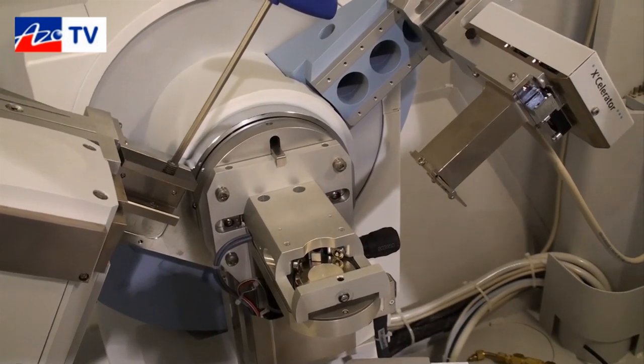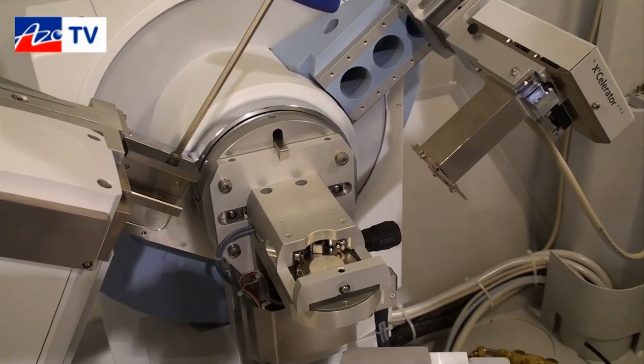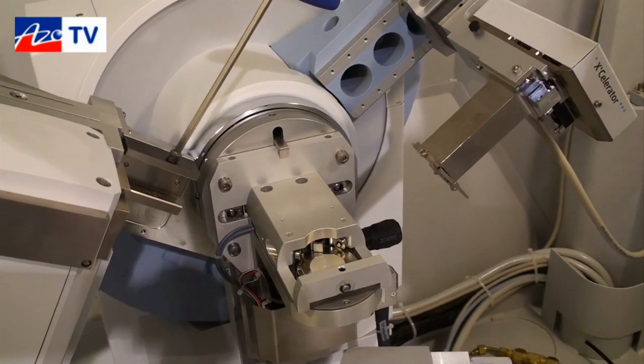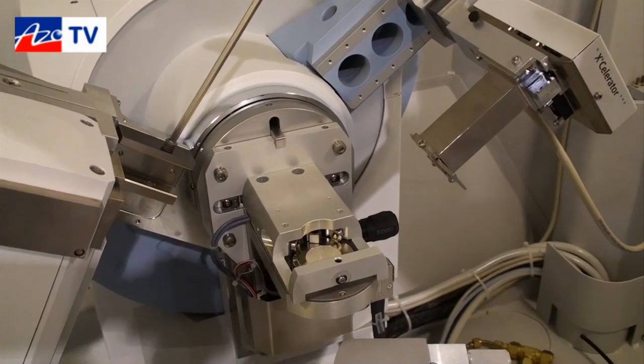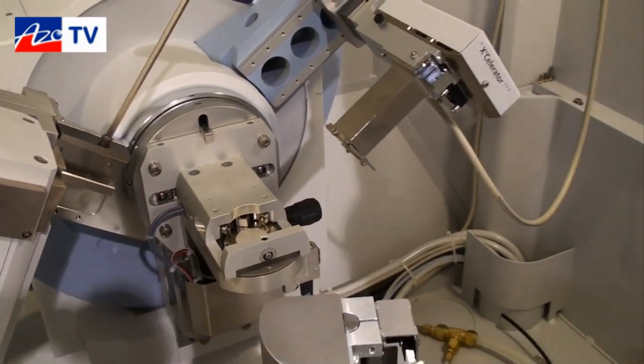Using either a point detector in parallel beam geometry or the X'Celerator for high-speed analysis allows users to reconfigure an instrument in just a matter of minutes. We also have two different things to look at on the system.